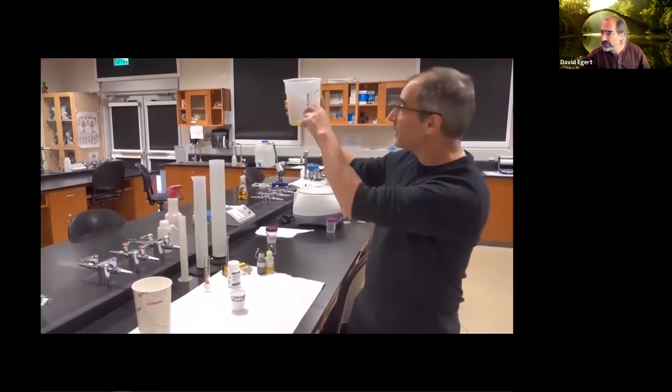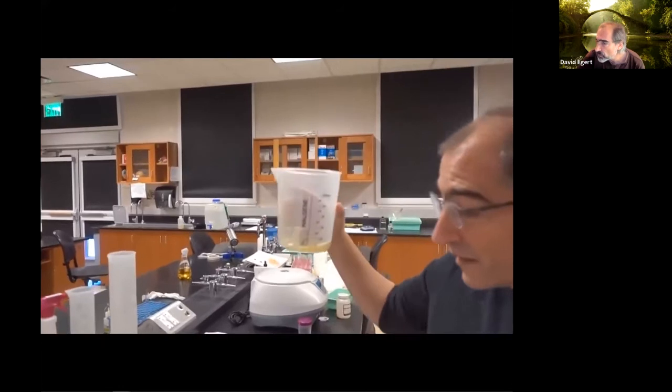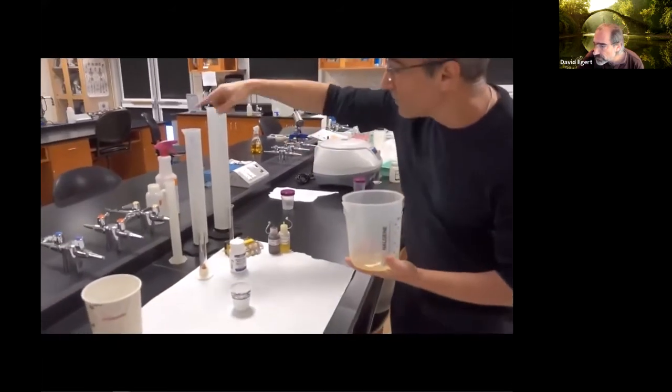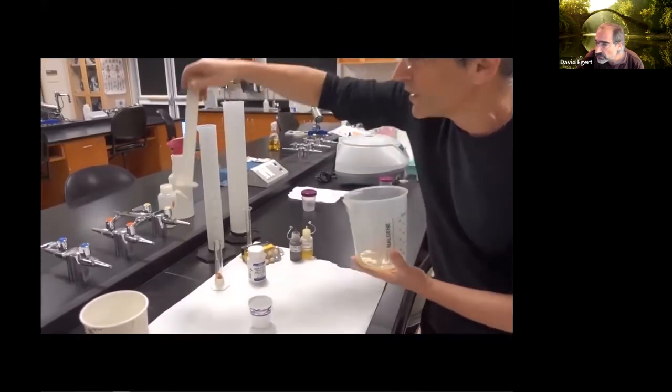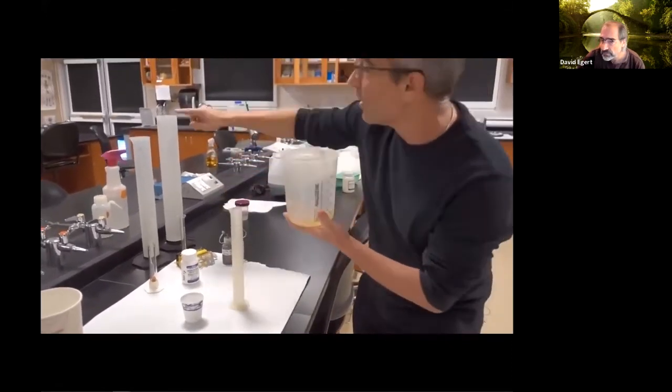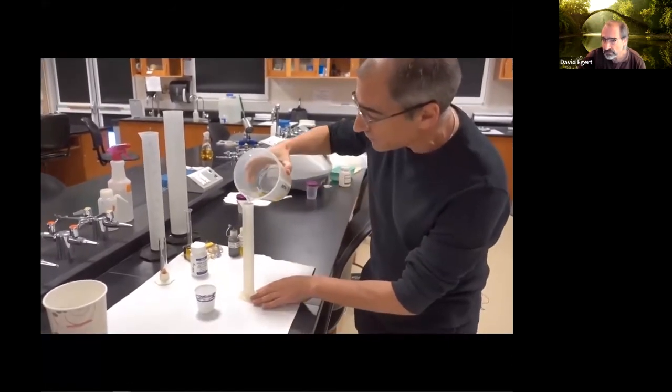I can look here, roughly, it's less than 100. So when I think about which one of the cylinders makes sense, I'm going to take the one that's 100. This is going to get lost if I put it in one of these bigger ones. So I'm going to pour it in.